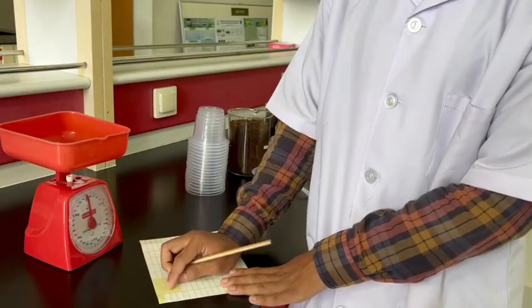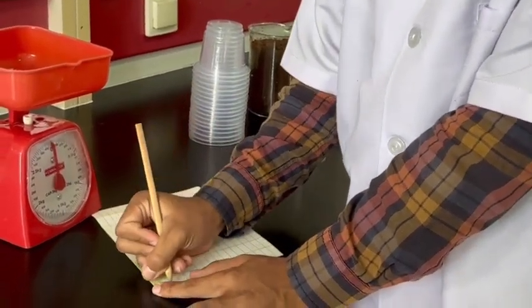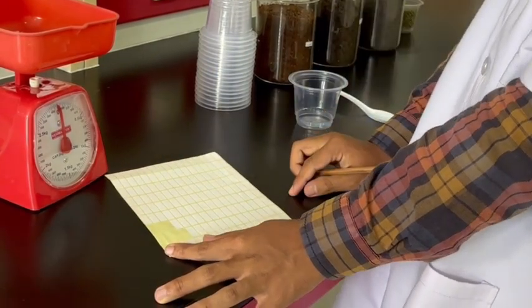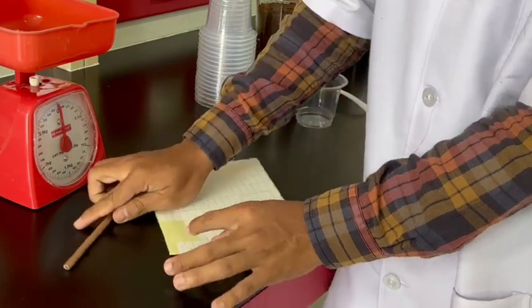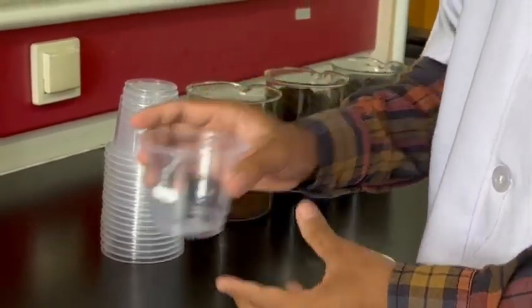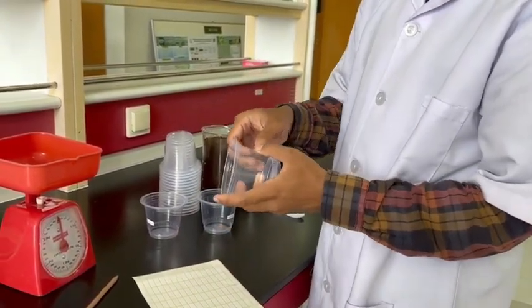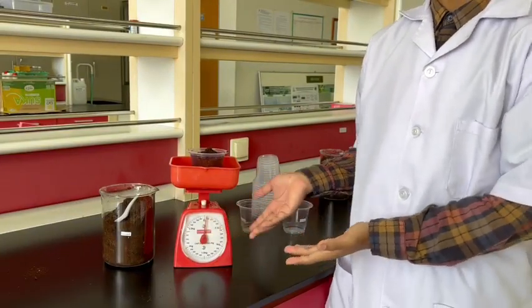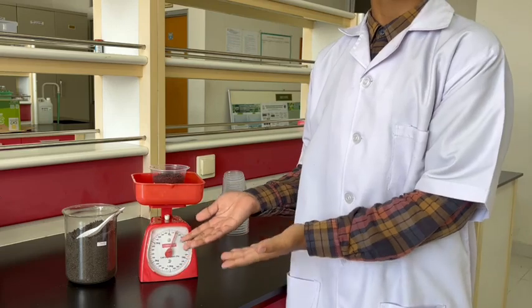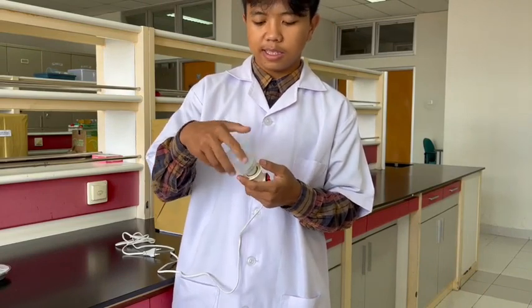Okay, the first step, I'm making a label for each variation of germination media, and this is for cocoa peat, this is for soil, and this one for sand. And make it stick on this, and I put this like that. And 100 gram for cocoa peat, 150 gram for soil, 150 gram for sand.